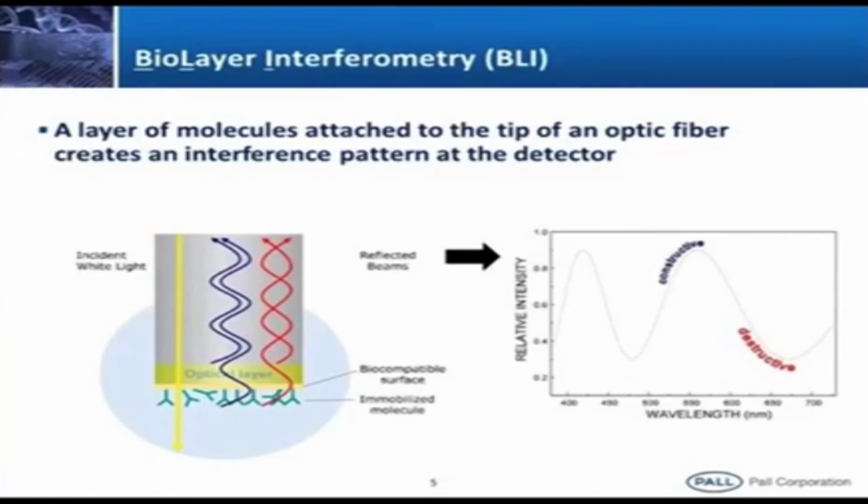When we say interference comes, suppose I put one stone into water, you see there are waves, right. If I put two stones simultaneously into water, what happens? Waves go that side, but on this side they mix together, and that is what we call interference. Here, due to this biocompatible matrix, there is always a kind of block, and some light gets reflected back. Only 5% of the light gets reflected, and the remaining 95% is transmitted into the well.